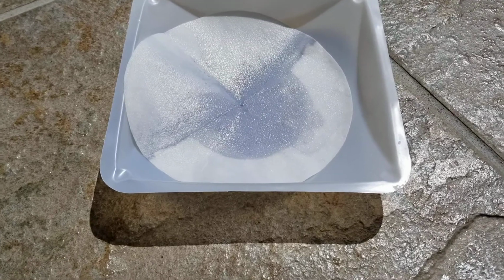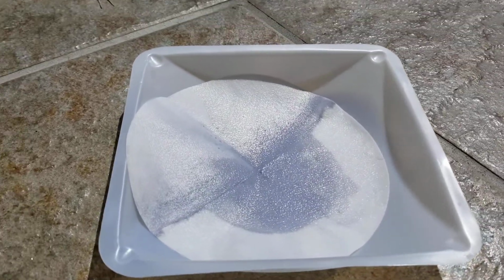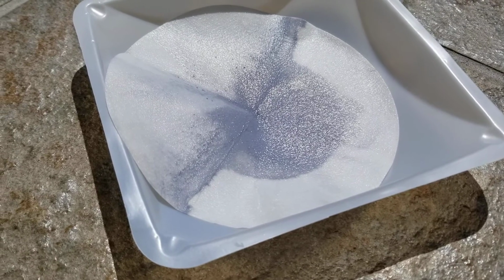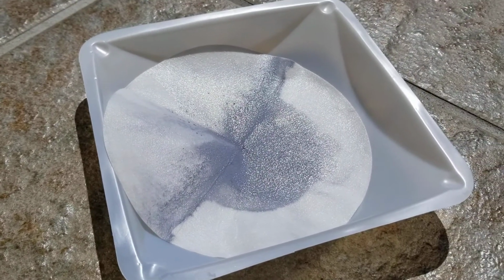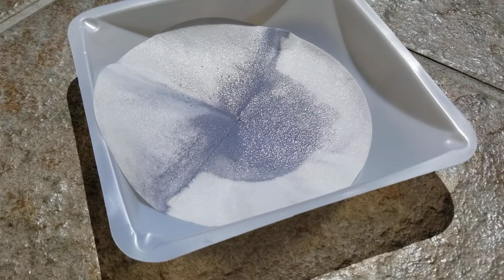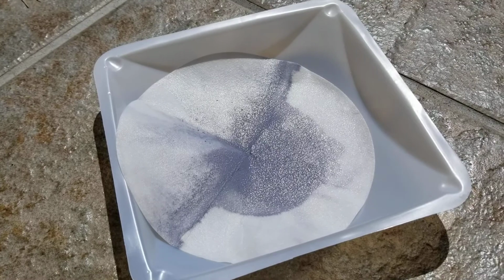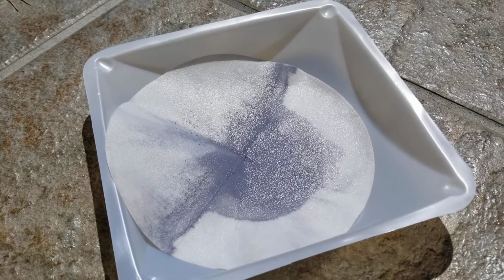So as I mentioned earlier, the sun has a lot of different types of radiation, but one of its key components is ultraviolet. And I don't know if you can see, but there is a significant color change. It's turning gray. So as the title of this demo states in the beginning, what we have formed here is a precipitate. The question now is, what precipitate did we form? Something I'd like you to consider and look into. That is the end of the demo.